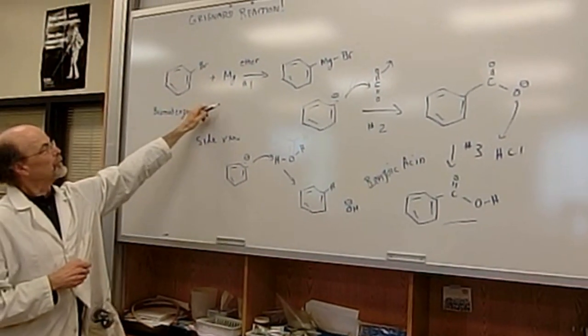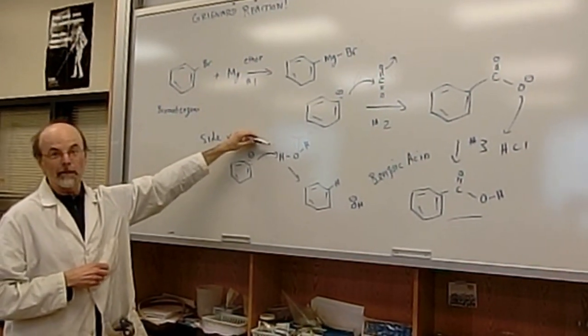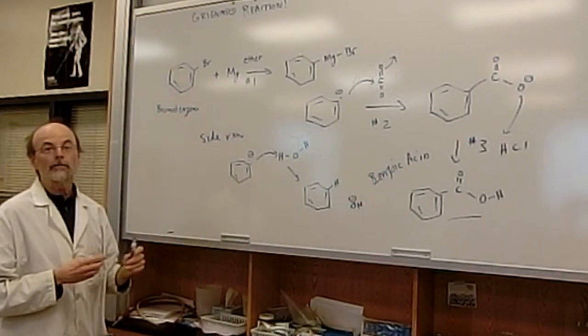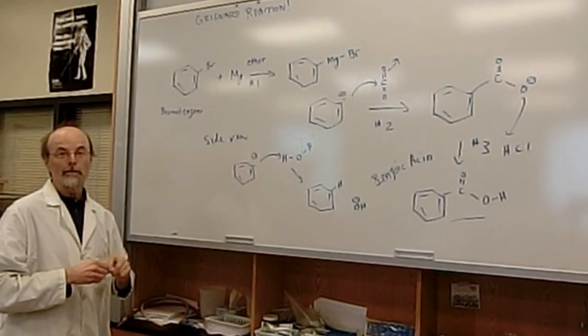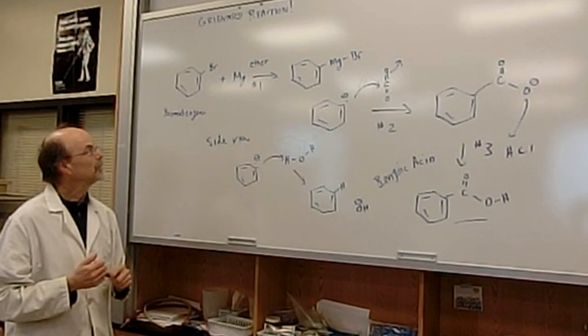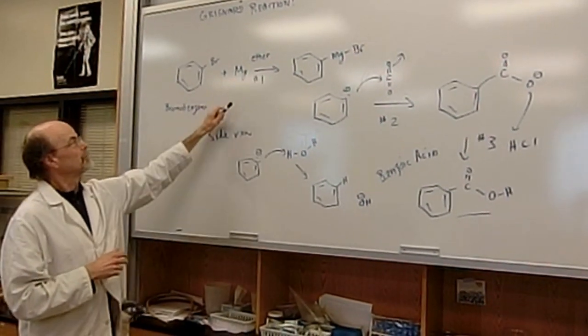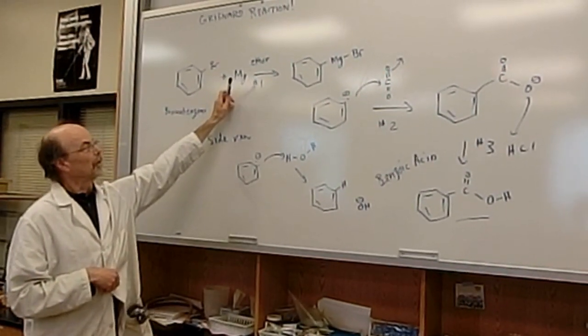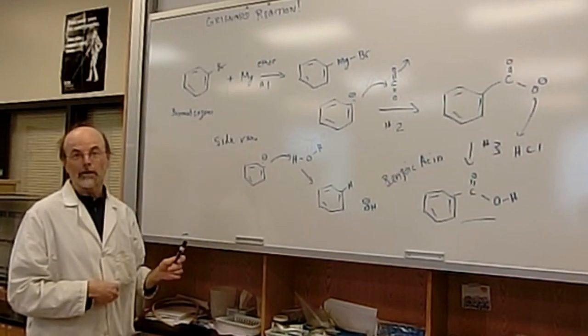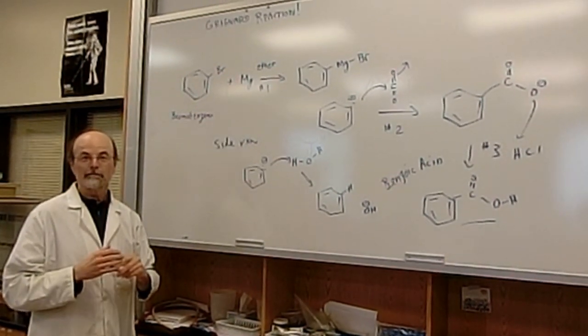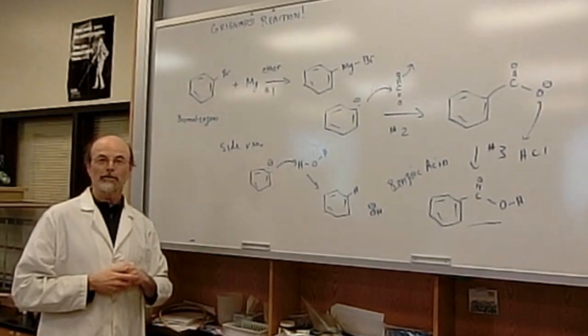So right off the bat, what we're going to do is to ensure that we don't have any water present. We're going to flame dry all the glassware we'll be using to make sure we dry all the water from the glass, and we also will be using very dry ether. Our reaction setup will have a drying tube on to prevent water from getting in the reaction. Right, so let's get to flame drying first off.